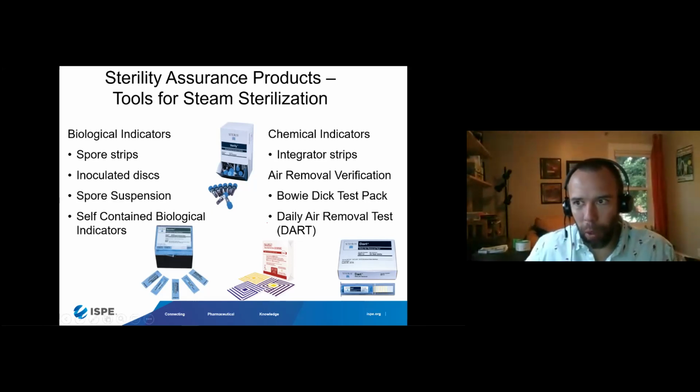So I know that was a pretty quick demonstration there, but I did want to go over a couple of these sterility assurance products with you.